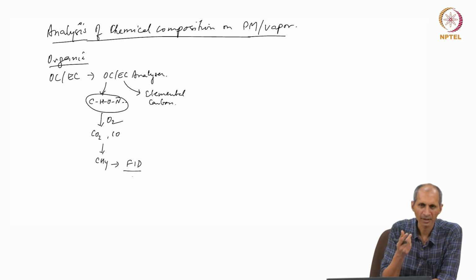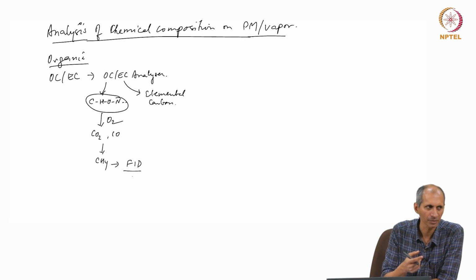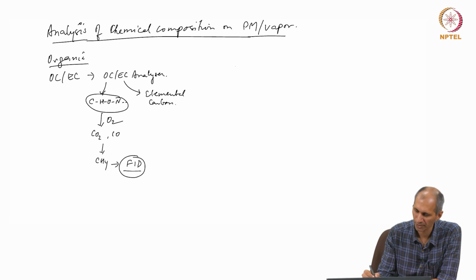The flame ionization detector is very sensitive. You can use a GC kind of system without the chromatography. There is no chromatography, but this is a detector used in the GC. So, they take the sample of the particulate matter on the filter directly. You collect a sample on a filter paper, you take a small part of this, and you heat it.